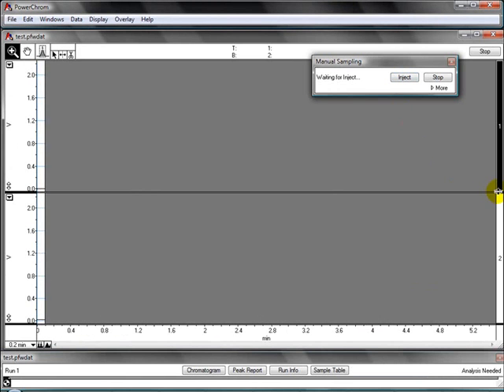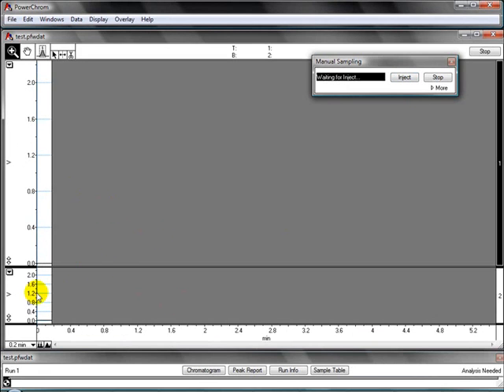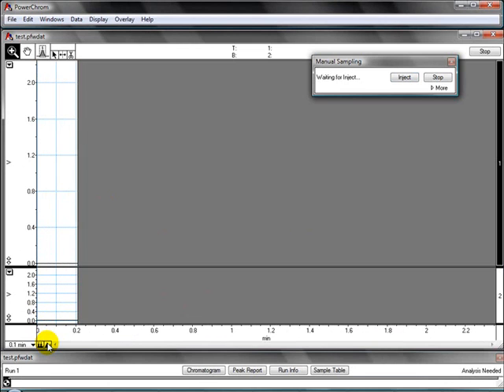You can remove Channel 2 to make it bigger because Channel 1 is the most important. And you can also open up the screen using these buttons.